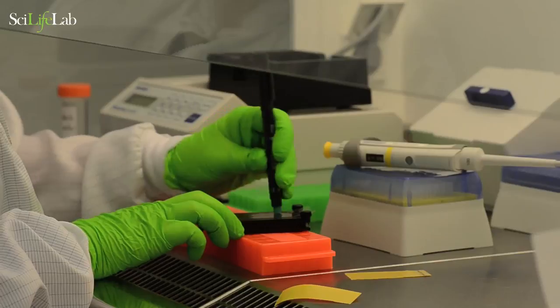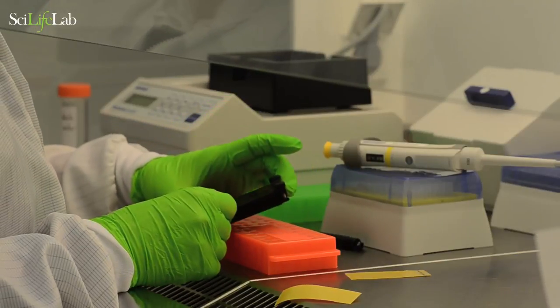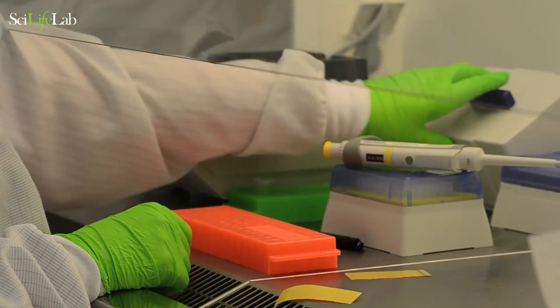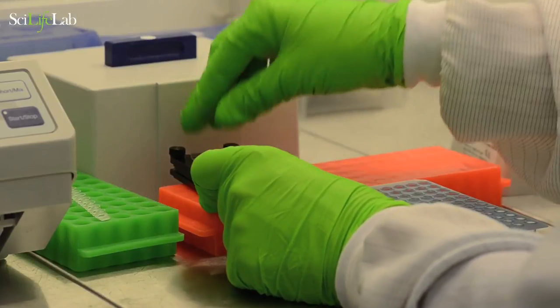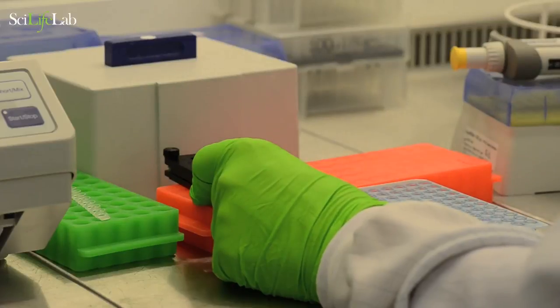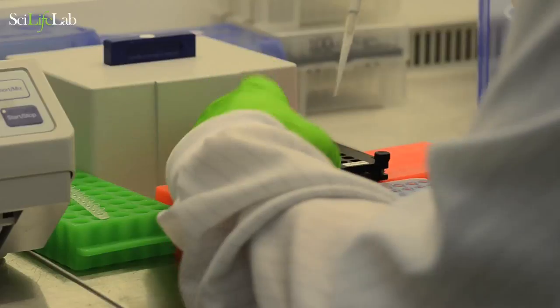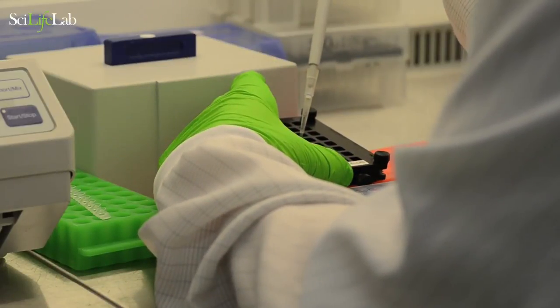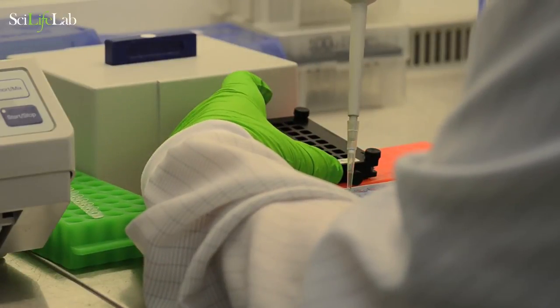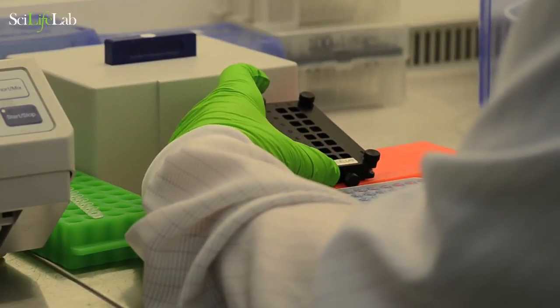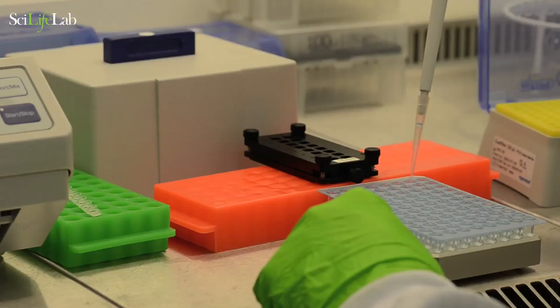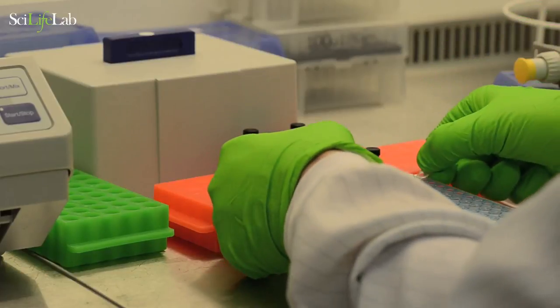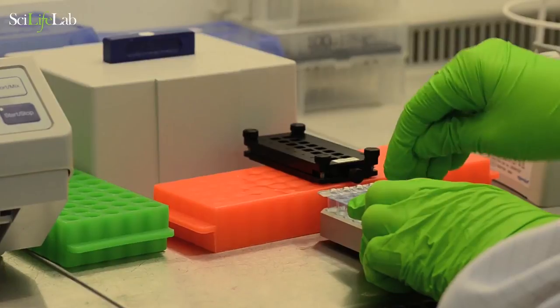Incubate for 2 hours at 37 degrees with interval shaking. Remove the seal. Take up 65 microliters and transfer either to a plate or to 0.2 milliliter tubes. Seal the samples. Samples can be frozen at minus 20 for later processing or taken directly onto library preparation.